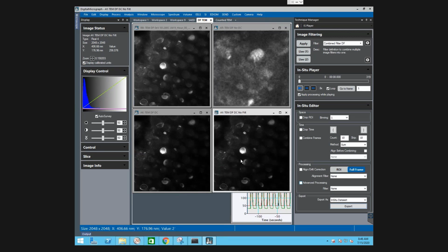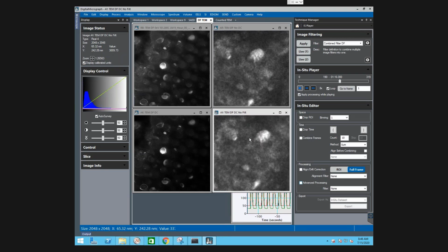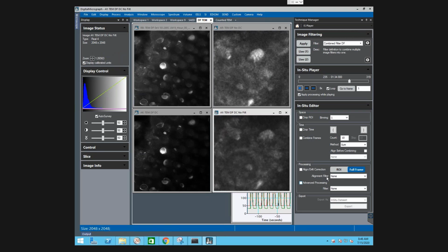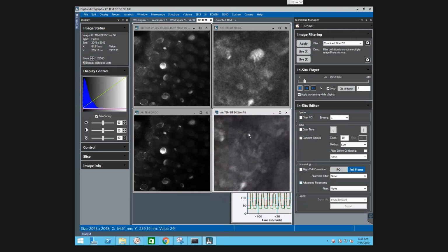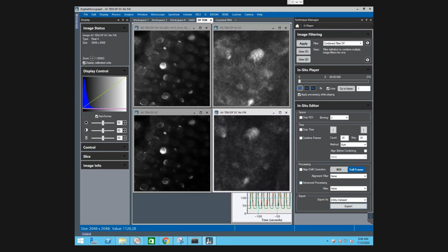And then if I go to this one, I'll zoom in again and play this one. So this has drift correction applied, but I'm not using any filter. I'm selecting here for my alignment filter, none. And you can see it's doing something, but it's not perfect. This particle is sort of drifting to the right over the course of the video. So I'm not very happy with that.